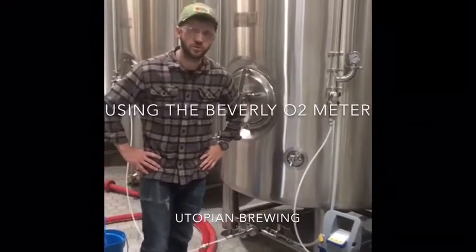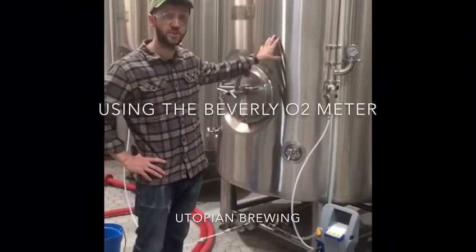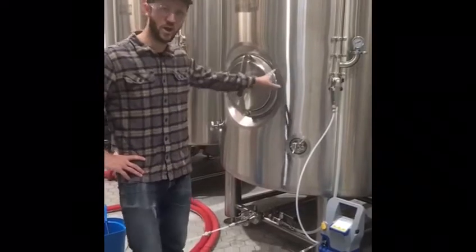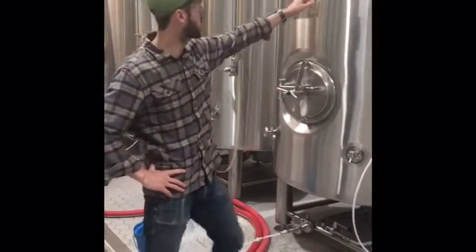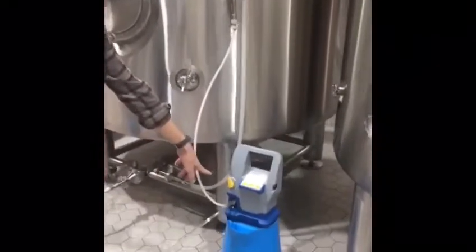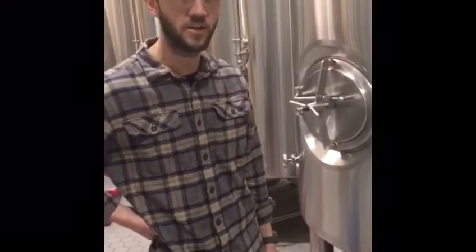One of the ways we're using the Beverly Oxygen Meter in the brewery is to test bright tanks before we transfer finished beer into them. Right now we're purging this tank with CO2 from the bottom, coming out of the CIP arm and going into the Beverly Oxygen Meter, where we get a live reading of the oxygen content in percent.